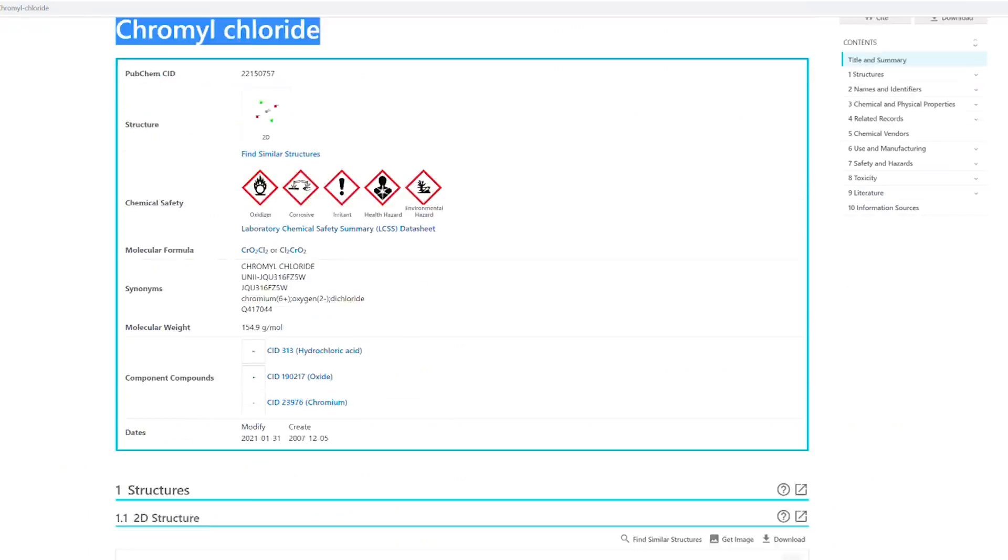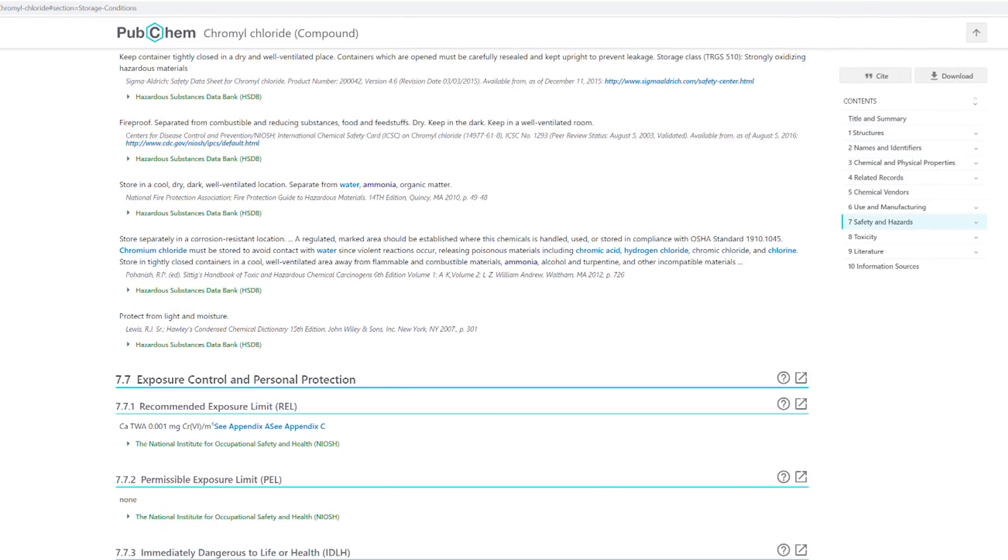I looked up a section about storage conditions in the chromyl chloride MSDS and I saw ammonia among other incompatible materials, which is quite obvious.